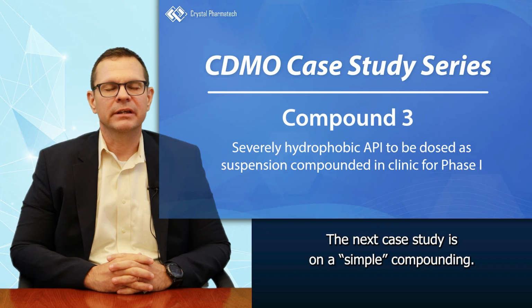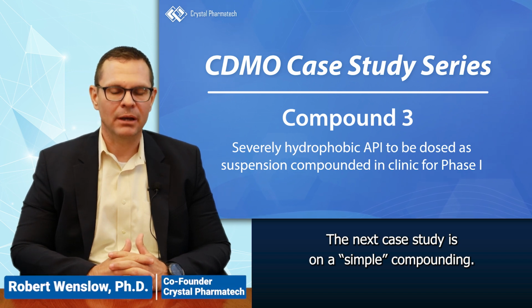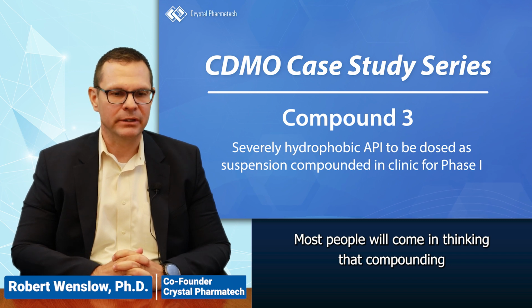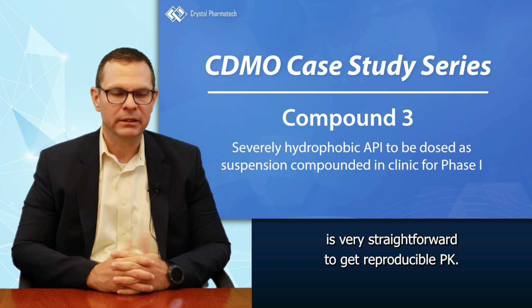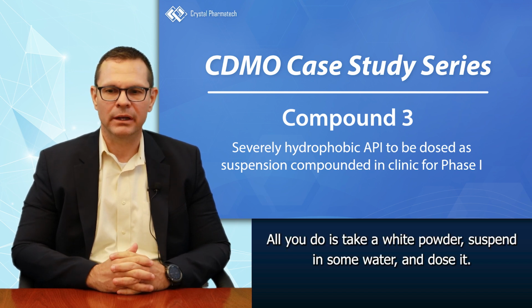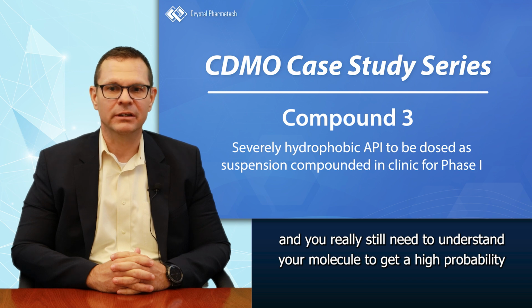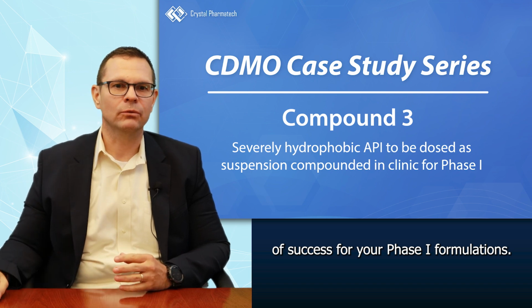The next case study is on a quote-unquote simple compounding. Most people will come in thinking that compounding is very straightforward to get reproducible PK. All you do is take a white powder, suspend it in some water, and dose it. You'll see in this case that it's not always that easy, and you really still need to understand your molecule to get a high probability of success for your phase 1 formulations.